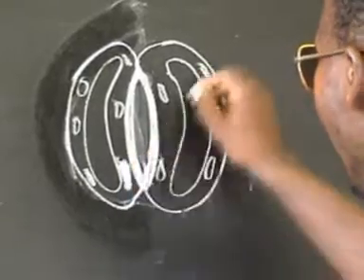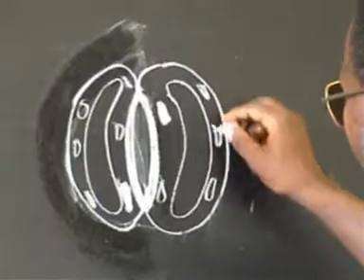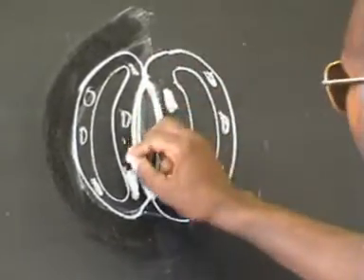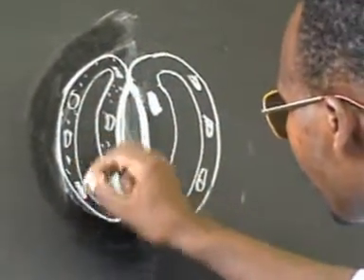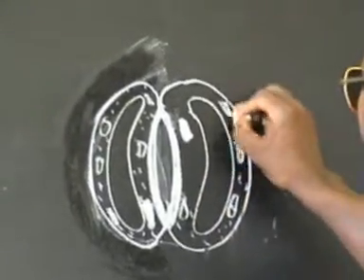The nucleus was very dark there like that. And then these ones are certainly the chloroplasts. So what I have here are the chloroplasts. I will dot the cytoplasm to make sure that this is the cytoplasm that has been dotted like that.